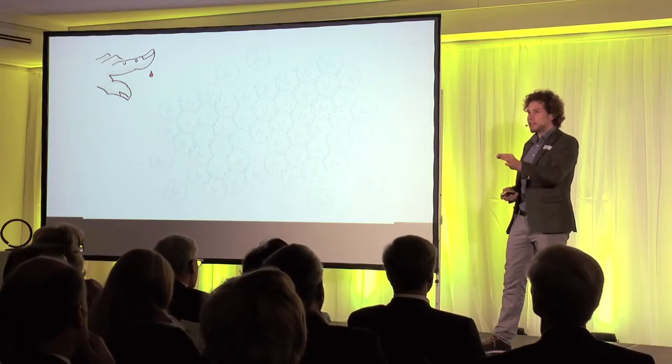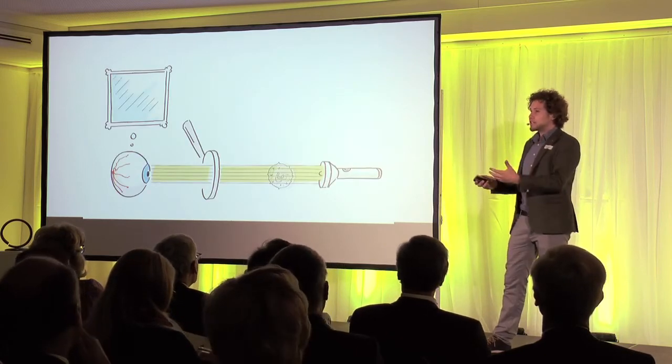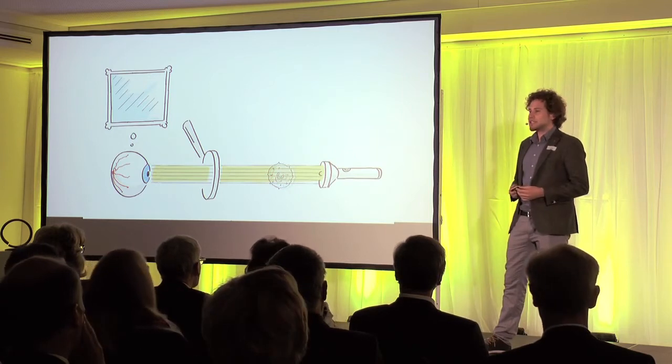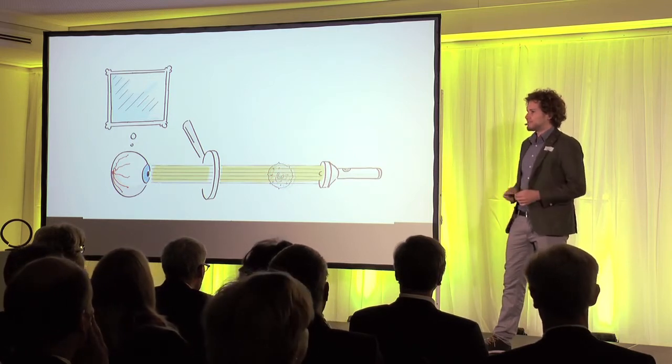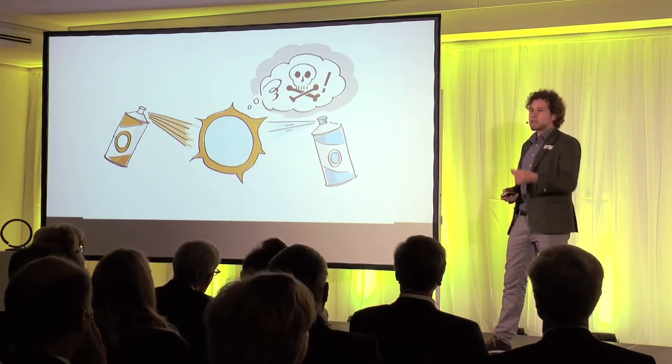Trouble is, if, for instance, you were to look at blood cells, these are very, very tiny. And despite the fact that a blood drop might appear red, if you look at the individual cells themselves, they are transparent. So this means if you look at cells under a microscope, you won't be able to see anything. This is why biologists have been using chemical markers for a long time to stain, to color the cells. The problem with these chemical markers is you basically kill the cell, so you can only observe dead cells.